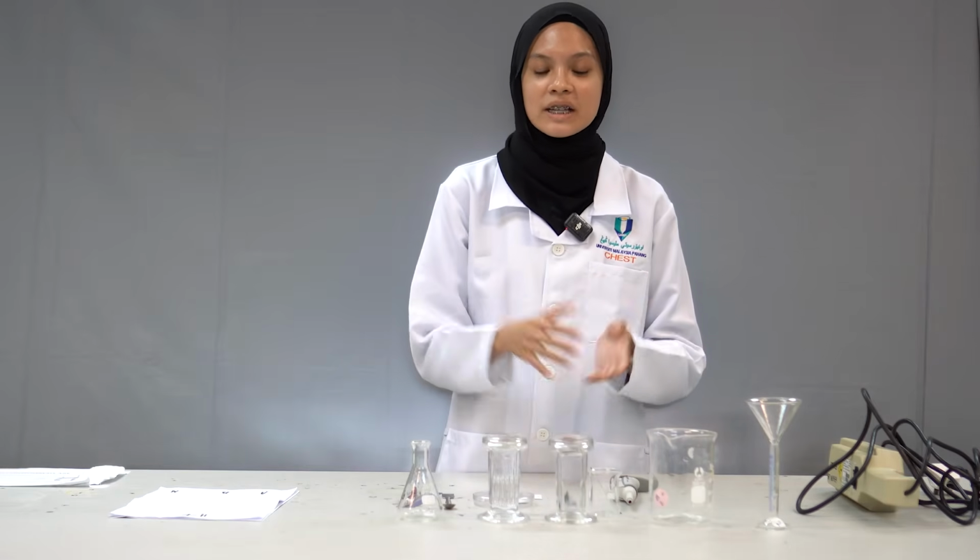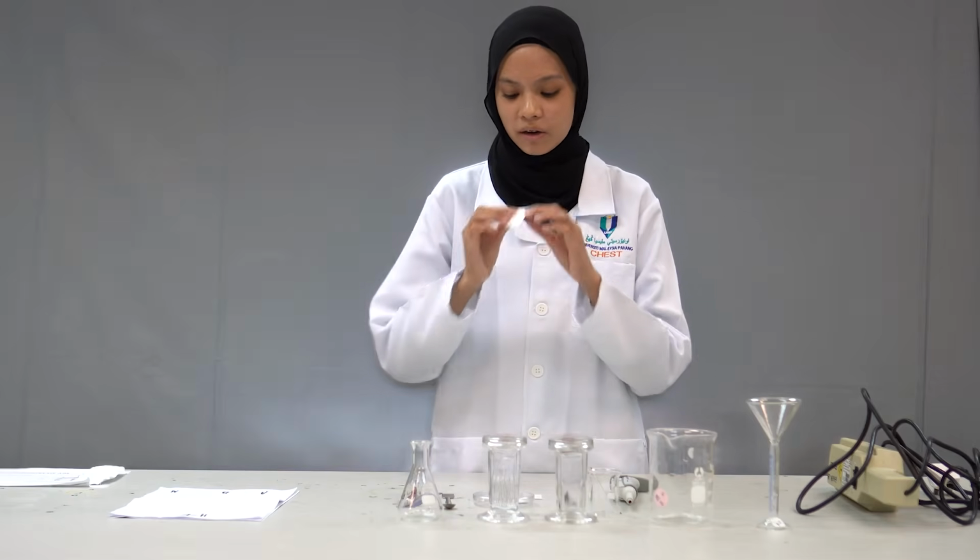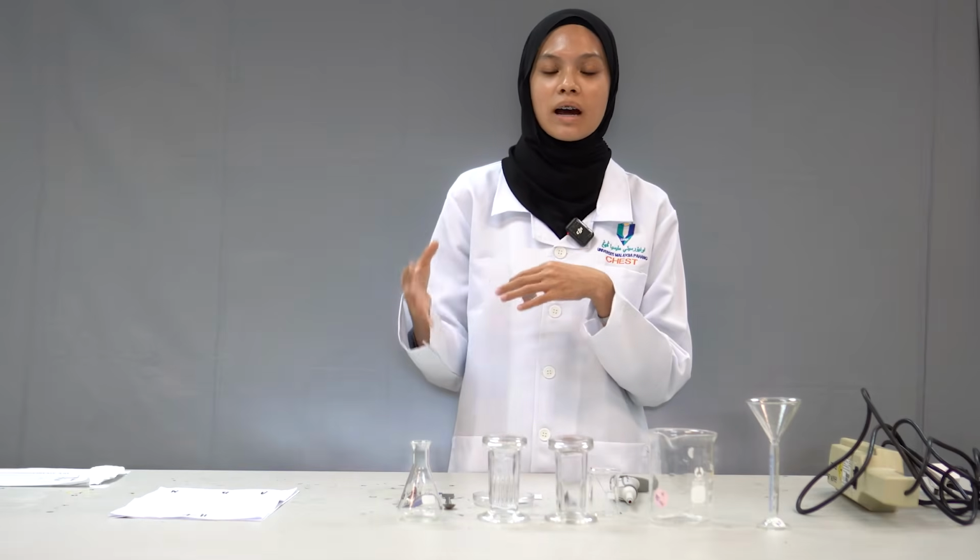So the polarity is chosen. So what are the expectations from this experiment? We are expecting the non-polar compound will travel further up to the top of the plate compared to the polar compound. By saying this, we are expecting the RF values, the retention factor, for the polar compounds to have lower values compared to the non-polar compounds.